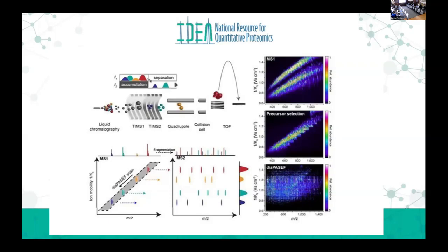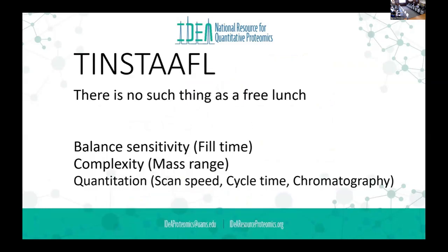The best data we have in our lab on DIA is from the TIMS. We just couldn't reproducibly get it to work day in, day out, as we need in a core to run. But like I said, our experience may not be yours, but mobility is definitely an advantage.